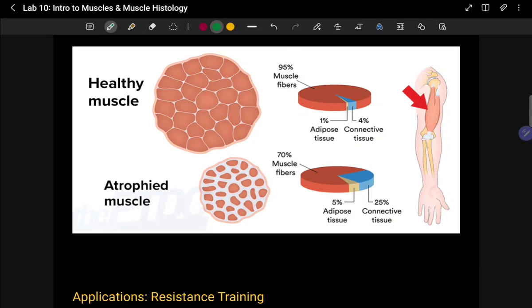In healthy muscle, when you're a 20 year old, your muscle is going to be pretty healthy. This is a cross section here, so what we're seeing is cross sections of muscle fibers. Each of these is going to be one of those individual muscle fibers, and this entire structure is going to be our muscle. This is very healthy tissue, mainly muscle fibers.